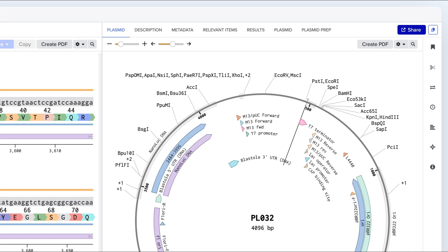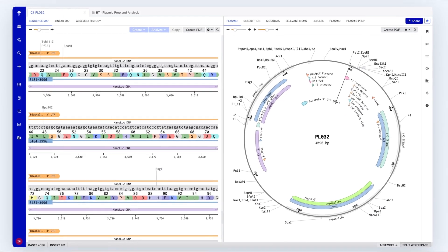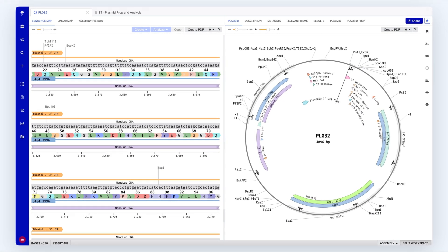Benchling also offers bulk design and analysis tools, including APIs, to automate sequence creation and updates.